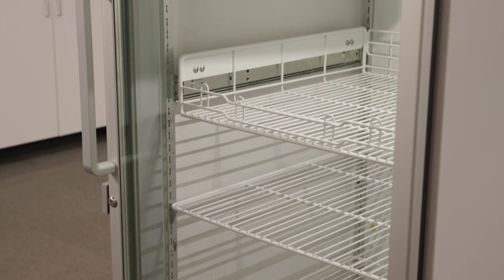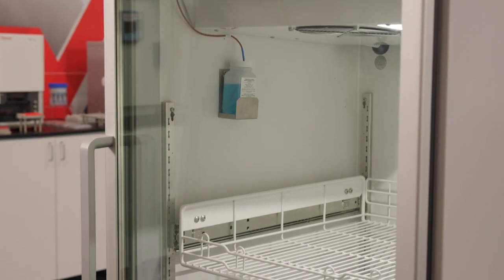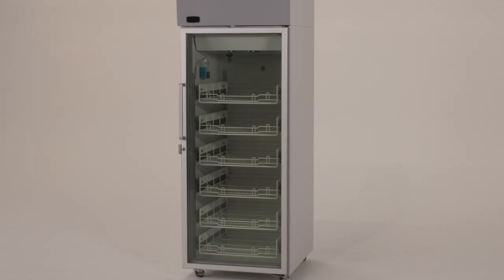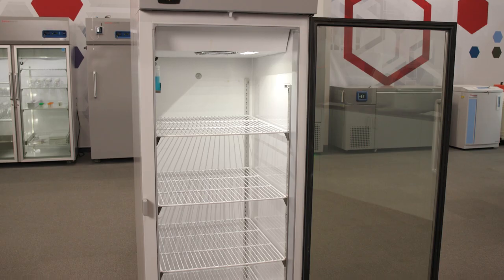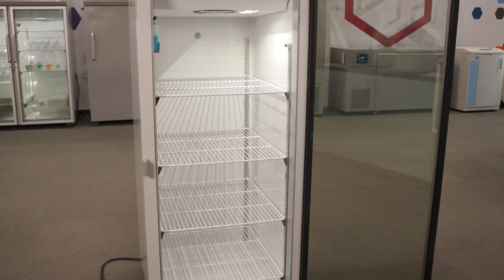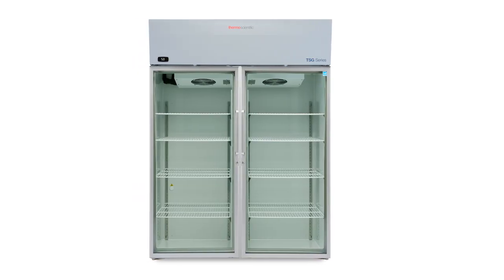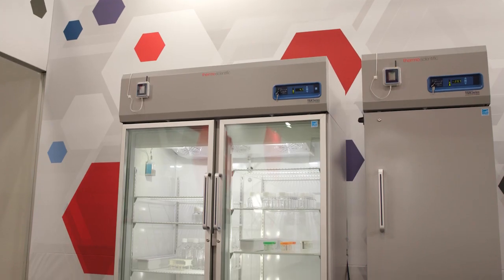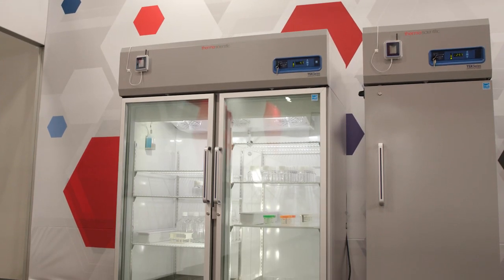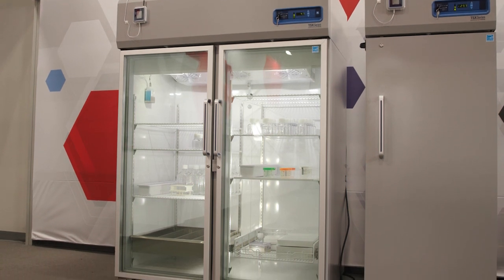Learn how to install the accessories included with your new Thermo Scientific TSG laboratory or pharmacy refrigerator. Depending on the model, shelving or baskets may be included. Four full shelves are included with all single-door TSG laboratory refrigerators, and eight full shelves are provided for all double-door TSG laboratory refrigerators. Customer-installed shelves or baskets may also be used with both Thermo Scientific TSX and TSG series refrigerators.